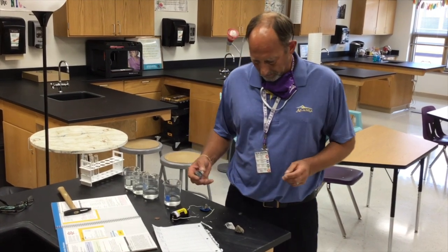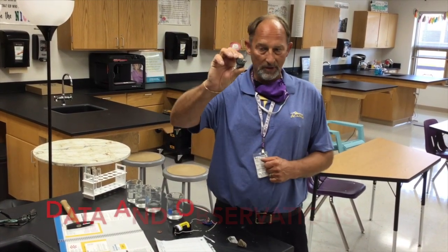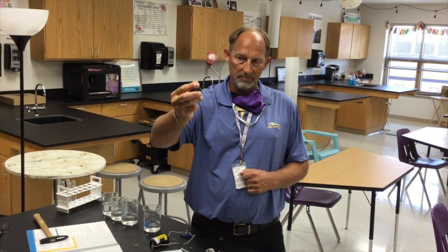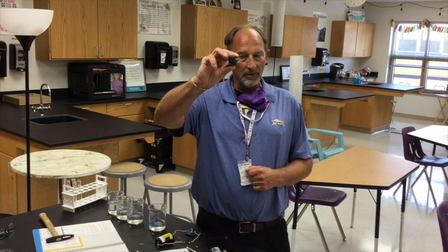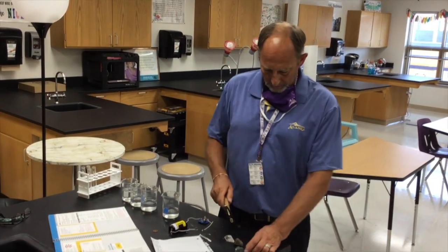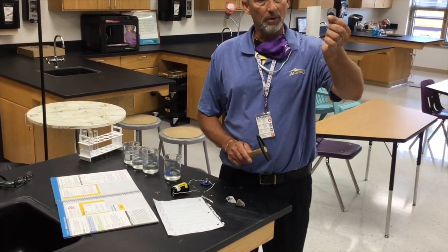When we look at galena, which is this one, physical state, obviously. You can see its color. Dull or shiny, obviously it's quite shiny. Texture, quite rough. Boiling point, we're going to work on that a little bit later. You're going to research that. The demonstration I showed you with the hammer, whether it's malleable or brittle, I think we can all realize. I don't want to break this. This would obviously be quite brittle.